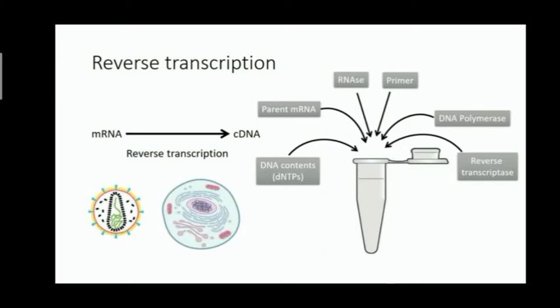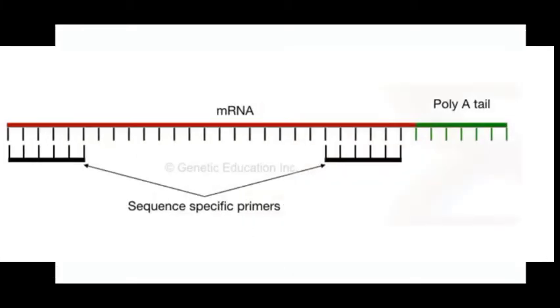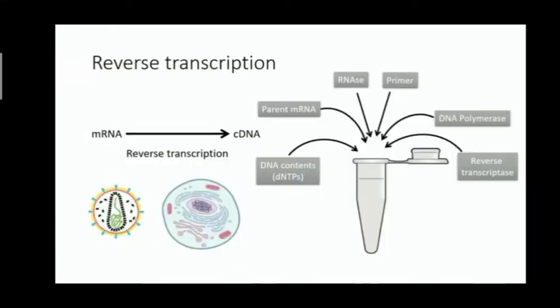We have to first extract RNA instead of DNA. Next, the set of primers for amplifying a gene is selected. Oligo-dT primers, random primers and sequence-specific primers are three types of primers commonly used here. However, which primer is applied depends on the type of RT-PCR assay.